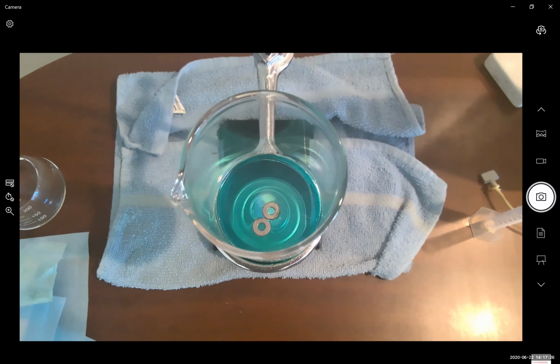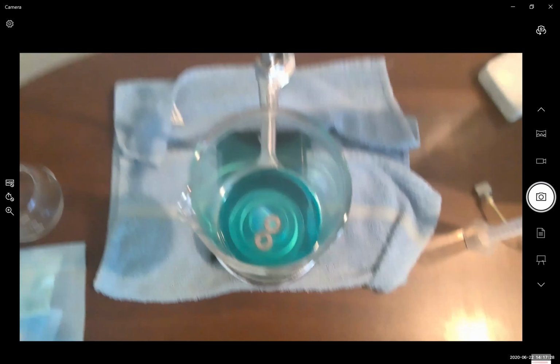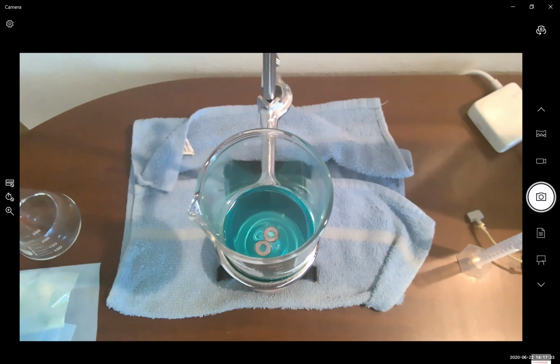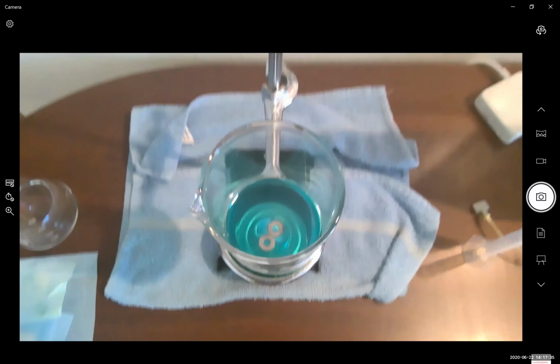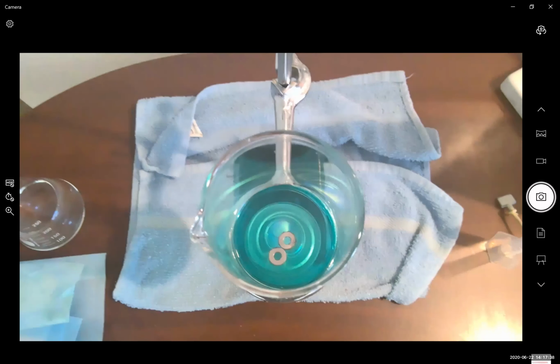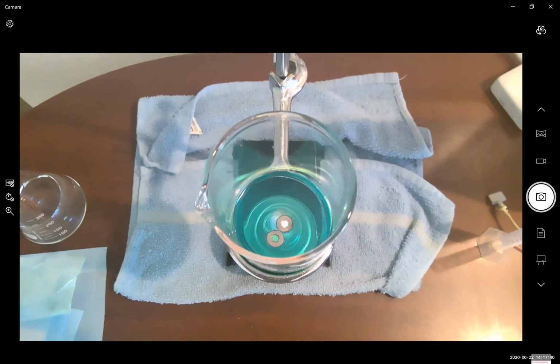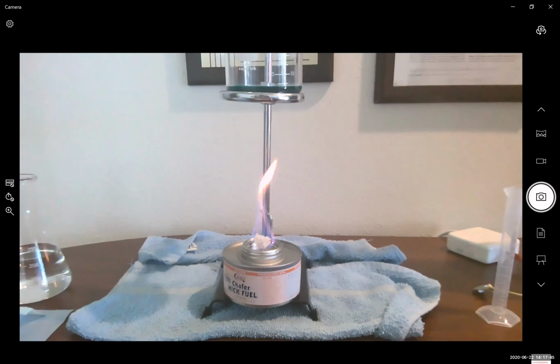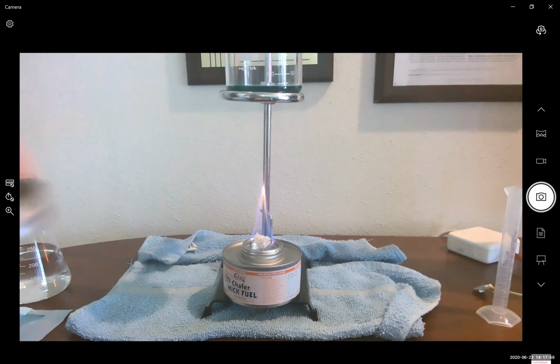That is a sign of a redox reaction. The aluminum is reacting with the copper in solution to make solid copper. That's why you're starting to see this brown copper color appear. This is a classic redox reaction. The bubbles, in fact, are the result of a little bit of side reaction where we're making a little bit of hydrogen gas.